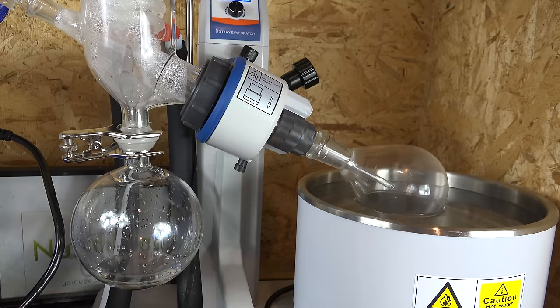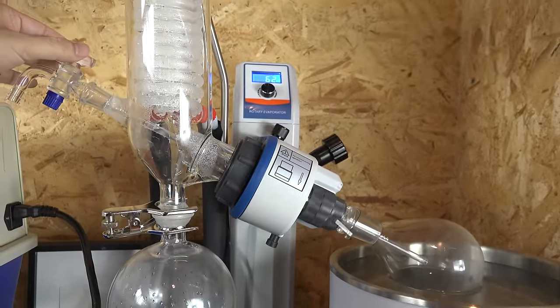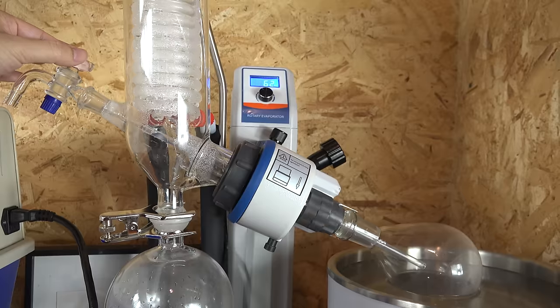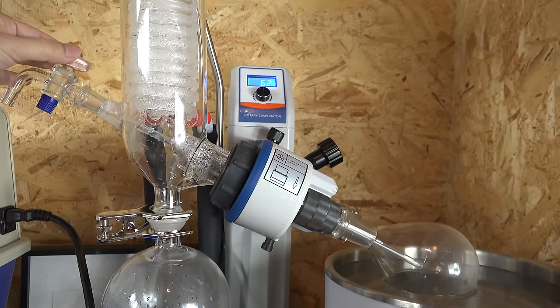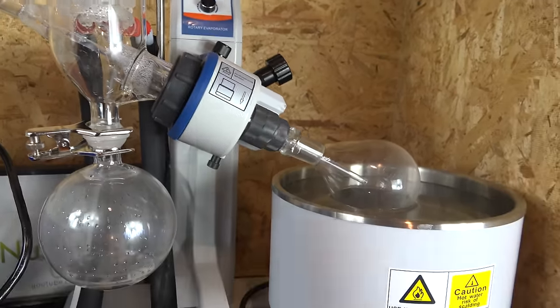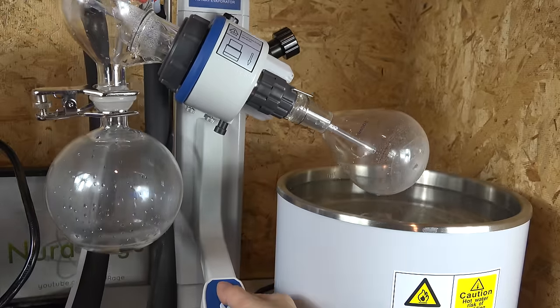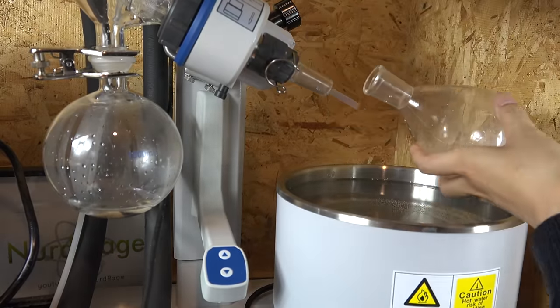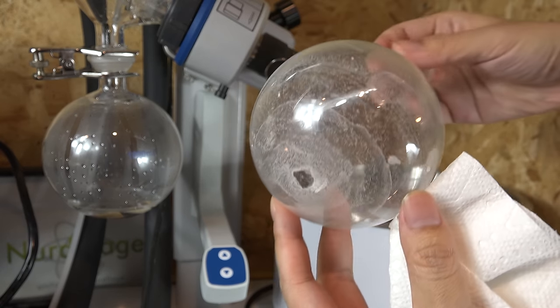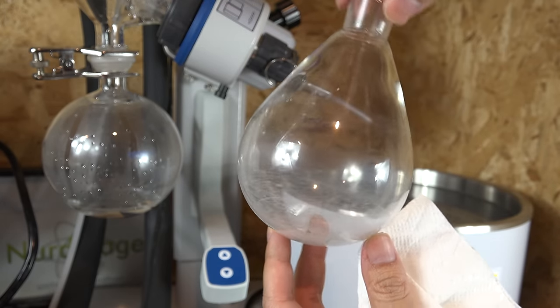It only took about another 20 minutes to finish — all done. To shut it down we first turn off the vacuum and let air into the rotovap, then turn off the rotation and lift the flask. We remove the flask and there is the residual tap water scale that we're pretending is some super valuable product. All of that took just 25 minutes.